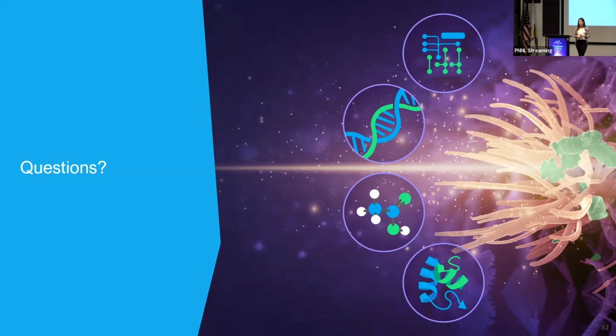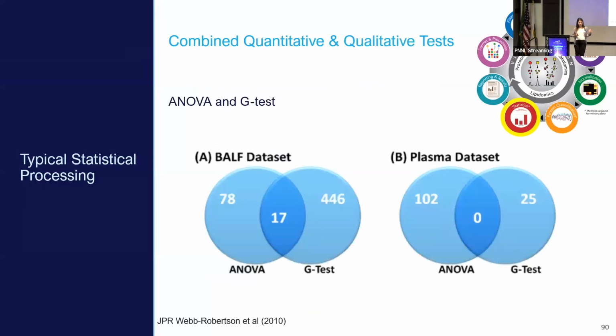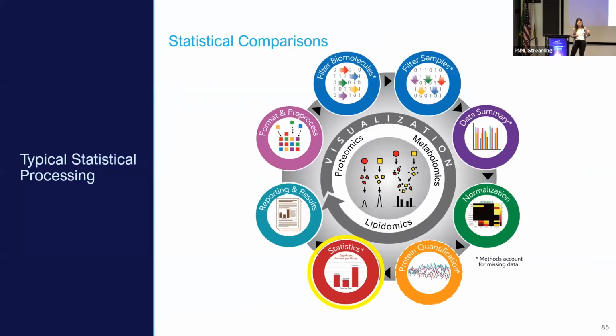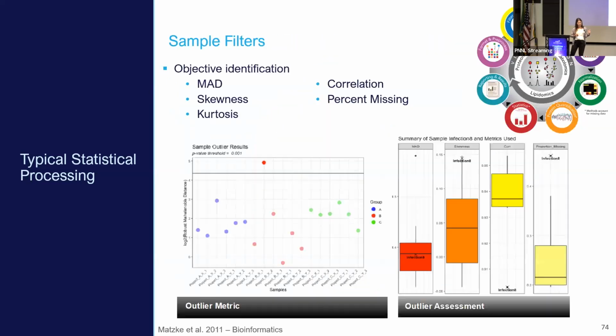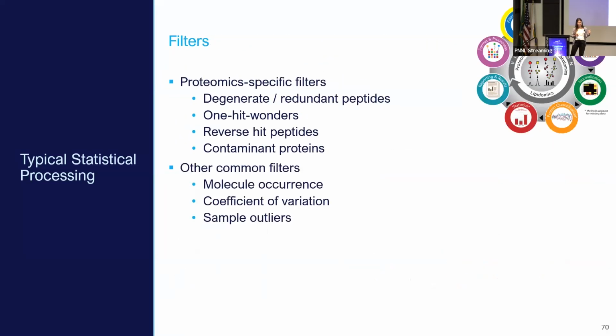On the user interface side, if you're not interested in diving deep into programming, MAP is the front end. It contains an app that's the front end for that R package, and that also has built-in safeguards. The tools that I mentioned on the slides are other options, but may have different levels of those safeguards. So MetaboAnalyst and MS stats. Let me find this so that you can see.